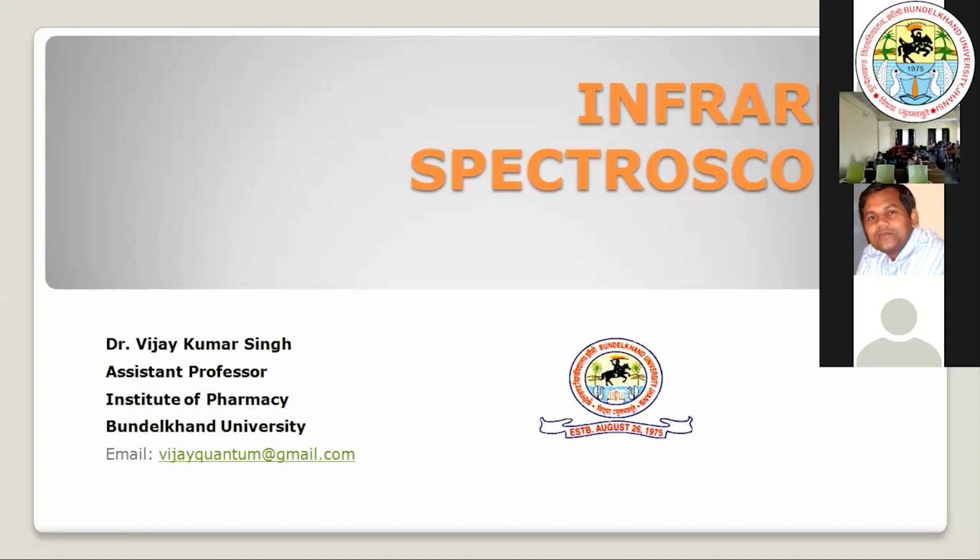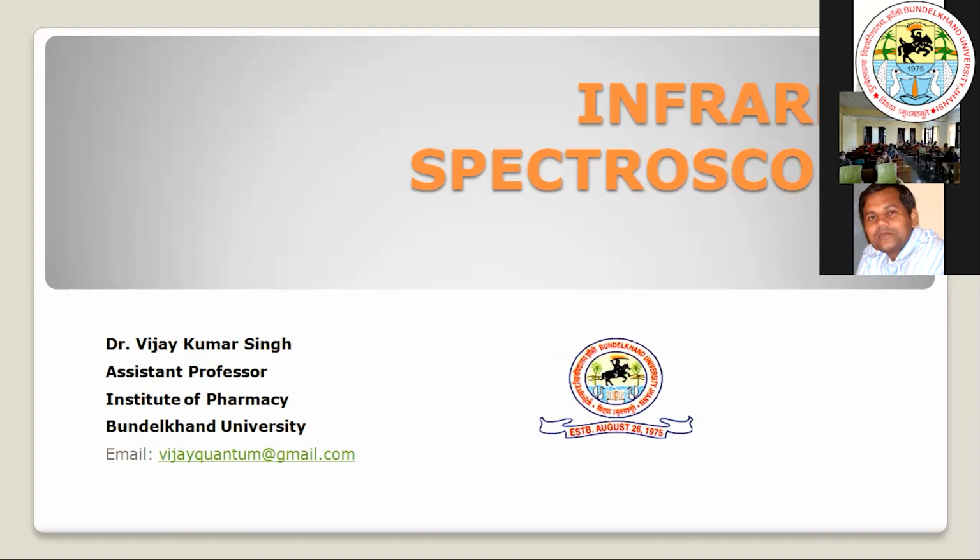In today's session, I am going to cover infrared spectroscopy, NMR spectroscopy, and atomic absorption spectroscopy related analytical tools. In this spectroscopic technique, basically there is an interaction of radiation with your sample, in every kind of spectroscopic technique. That's why we use the term spectroscopy, whether it is UV, that is ultraviolet related, infrared, NMR spectroscopic techniques, etc.